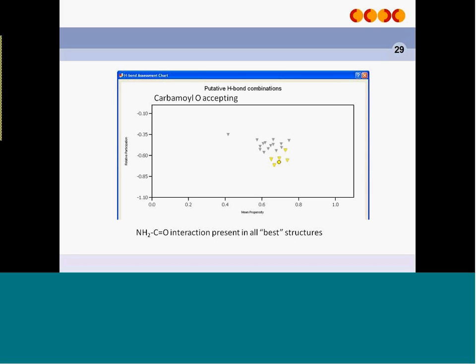additional information when you're perhaps assessing a polymorph or looking for other polymorphs, or in fact maybe if you want to design a co-crystal, for example, other interactions which might be hard to disrupt, other interactions which would be easier to disrupt, for example.